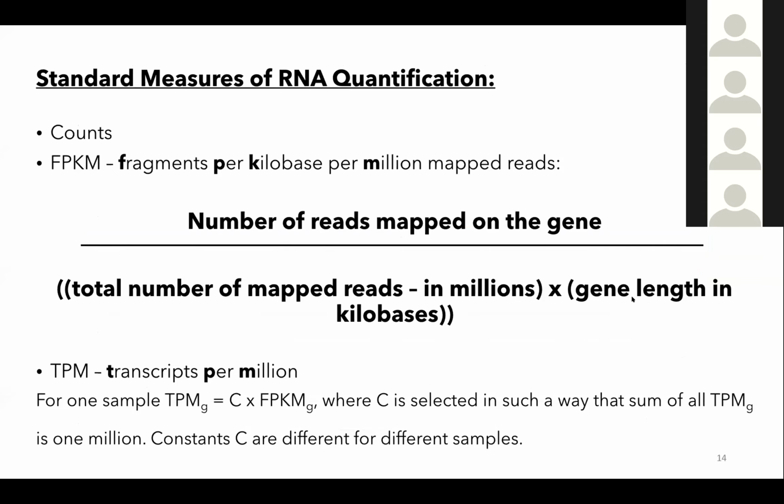Now the formula is actually very simple. All it says is that because these are different samples that were maybe prepared in a different way, they have a different number of total reads available to that sample, and the genes are different. Some genes are just 1,000 nucleotides long, some of them are maybe several thousand nucleotides long. So just on average, if you have those two variables, you might want to account for that variation when you compare a group of samples versus another group of samples.